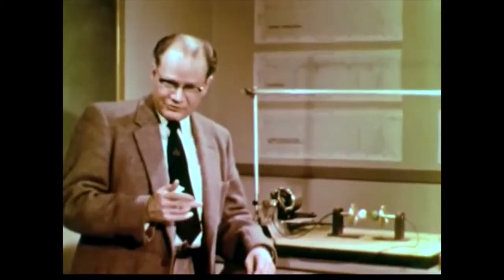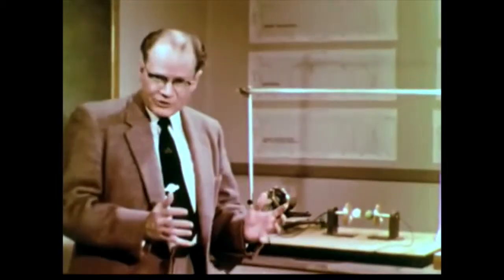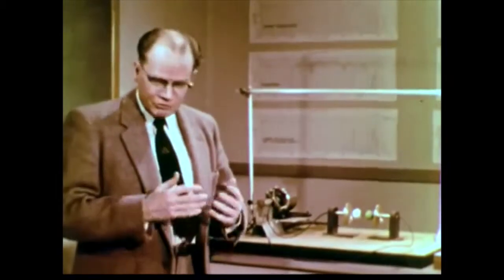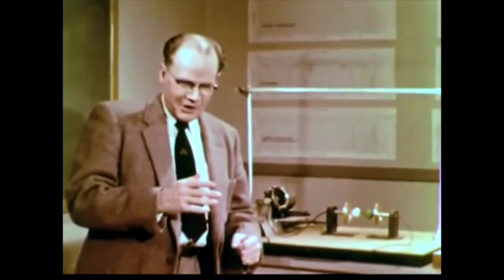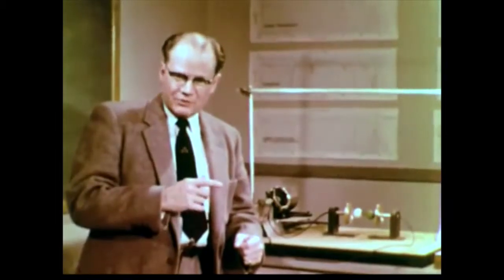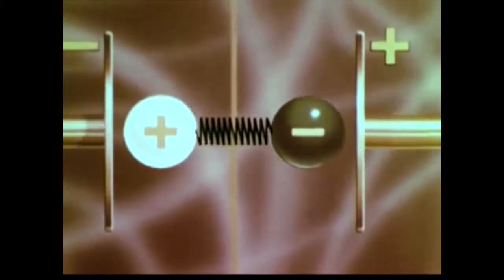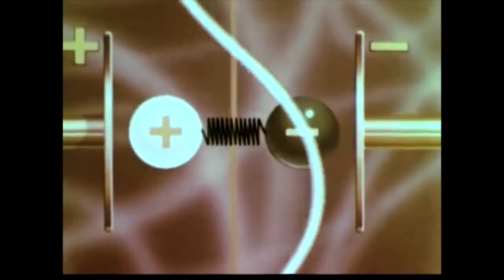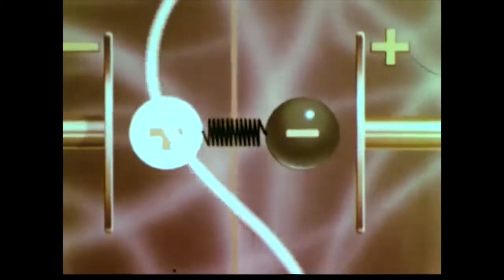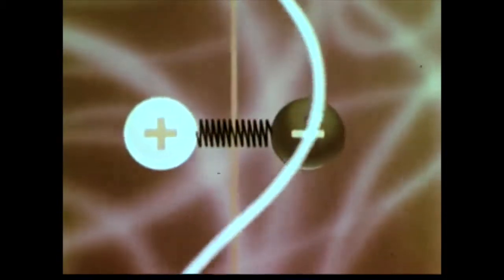If the frequency of the light wave is the same as the natural frequency of vibration of the molecule, then there'll be synchronization. The molecule will absorb energy from the light wave, and the molecule will vibrate more and more vigorously. Now, the way in which the light wave lays hands on the molecule has to do with the fact that the light wave is accompanied by an oscillating electrical field, while the molecule has different electrical charges on its different atoms. The left to right electrical field will push the positive atoms a little to the right, negative atoms a little to the left, and the right to left electrical field will do just the reverse.